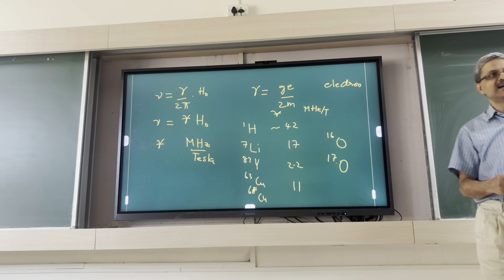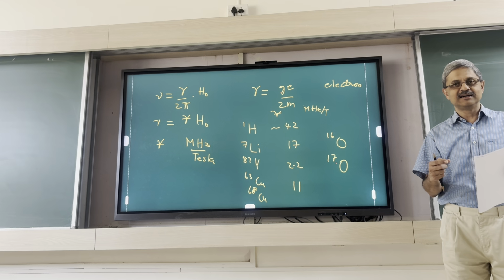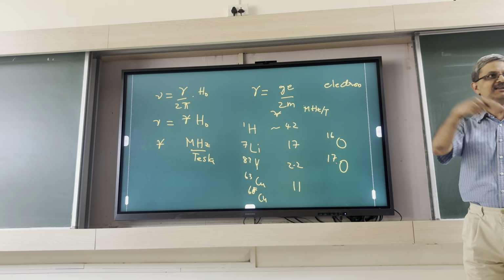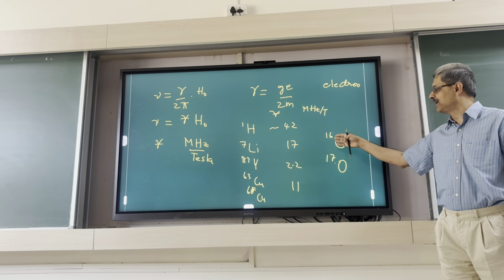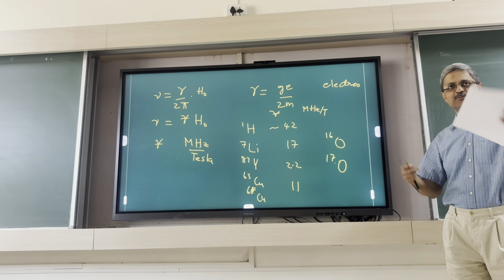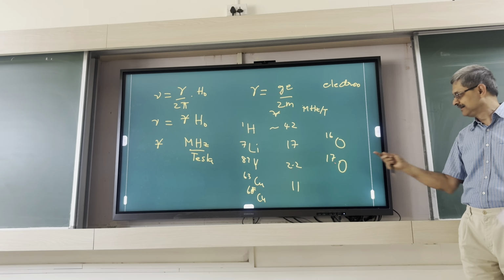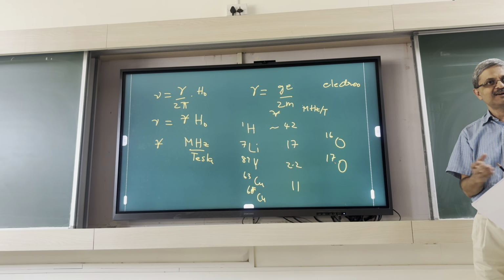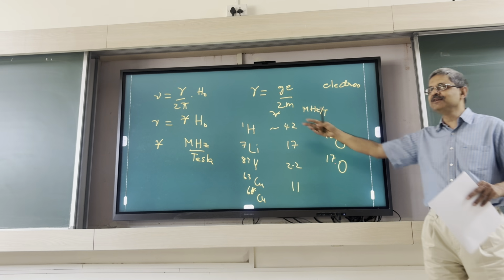But people do that. You buy that and you're preparing your sample and you're using oxides, and you have a chemical process such that you insert oxygen 17 in your sample. In your usual sample, you had maybe 0.01%, whatever the natural abundance is. Somebody has purified oxygen 17, you take that and use it in preparation of your sample. So you insert oxygen 17, and that has a magnetic moment and then you can do experiments.